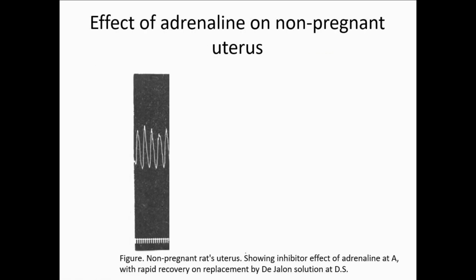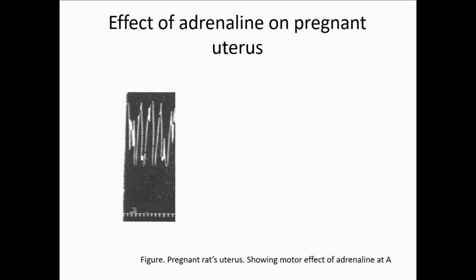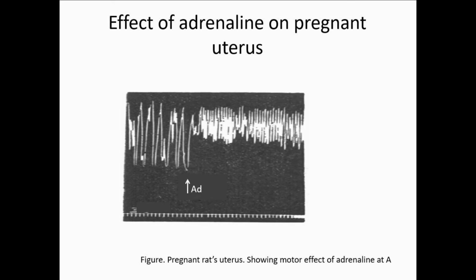The kymographic recording shows the pattern of contraction on non-pregnant uterus. Addition of adrenaline shows inhibition of contraction, which is recovered rapidly by De Jalon solution. But the pattern of contraction is different in pregnant uterus. Addition of adrenaline shows rapid contraction instead of relaxation.